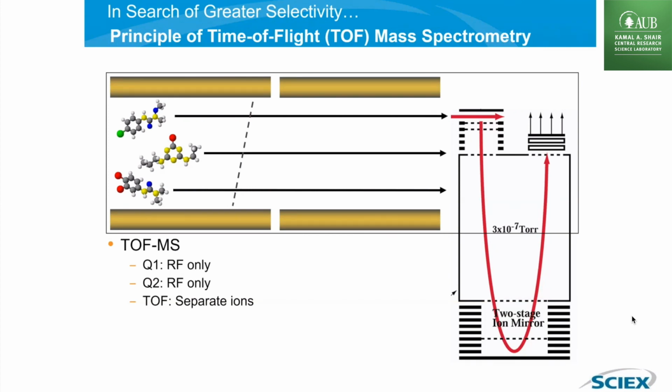And you, as the user, you can choose the mass range. So maybe you want to scan from 100 to 1,000, or I can't remember exactly from the email that you wrote, but I think you said 200 to 2,000 or something, right? So you choose the mass range based upon what's your idea of what's in your sample, and you get a mass spectrum then of what's present.